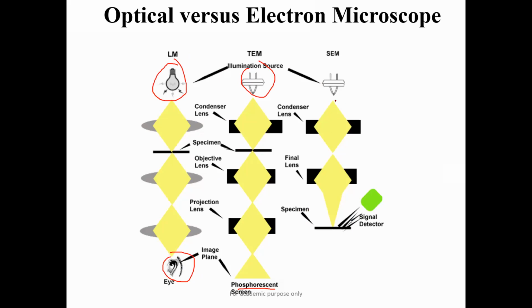However, SEM is different from the optical microscope and TEM. Its strategy is altogether different. Why? Because we are not examining the transmitted electron beam.